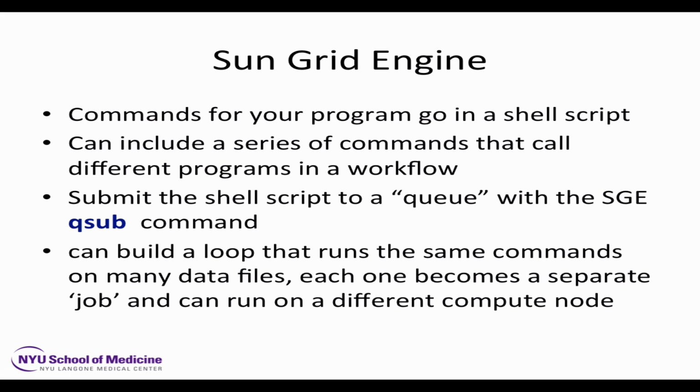One point about the loop: it's preferable, rather than doing a loop that does separate qsubs, to do an array job. Unfortunately, we didn't cover array. That's an advanced topic. Use the user's guide or meet with these guys and learn how to move up to the next level of complexity. I'm not showing you how to do that. I'm just telling you that it's possible.